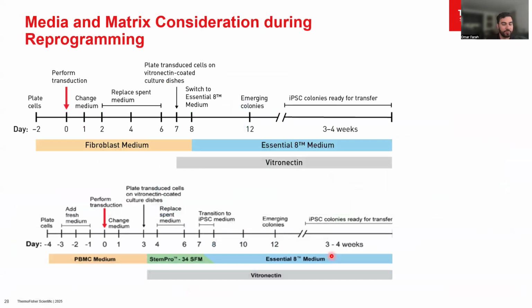Sweet. Now, we talked a lot about the different reprogramming methods, the protocols, but what are the cell types, or what are other considerations that can affect your reprogramming process, right? And I would argue that that also includes the tail end of this protocol. We talked a lot about the beginning, what cells you're using, how long you're culturing them for, and what media.